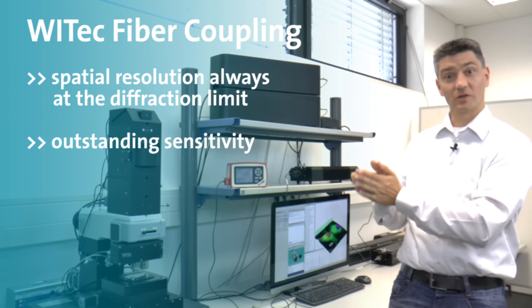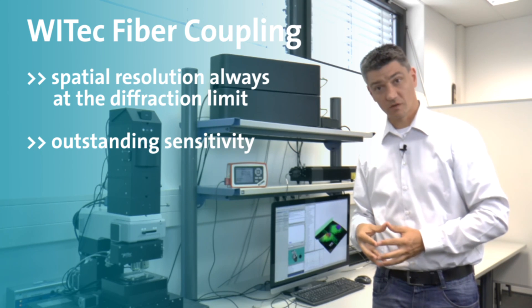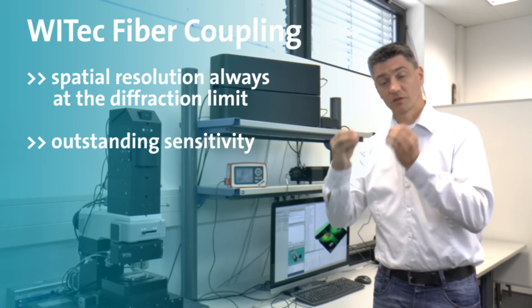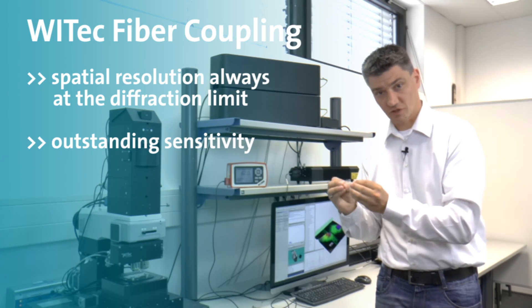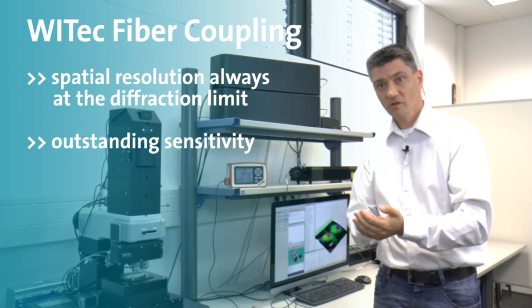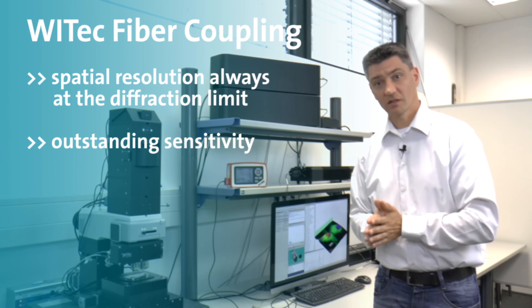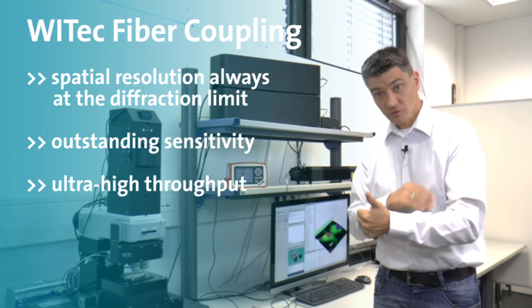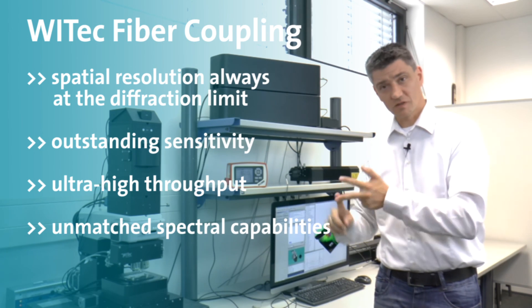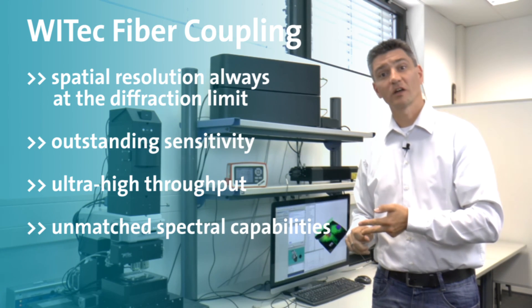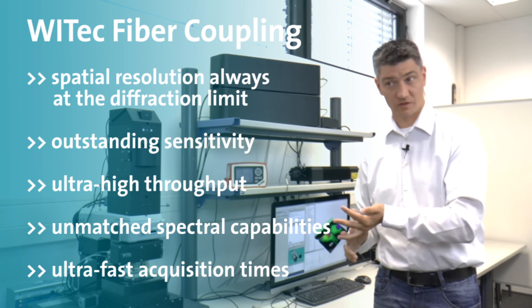In addition the photonic fibers allowed us to re-evaluate our design of the spectrometers and we did so and then we optimized it to keep these spectrometers at the cutting edge of technology. So not sticking with the same design but re-evaluating it whenever new technology is there to keep them at the cutting edge and this gives you highest throughput, best spectral resolution, best beam shape so your Raman bands exactly look like they in theory should look like and in combination with the cameras the highest speed.